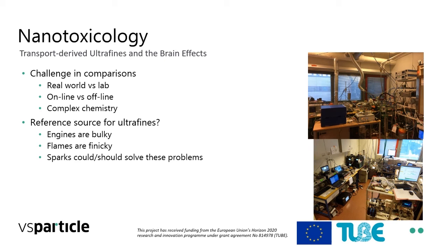Our goal in that is to try to figure out if a spark generator could be a good reference source for ultrafines, because, well, engines, they're just bulky. You just need a lot of space to get them running right. Flames, they are not very convenient sometimes because they have a mind of their own.